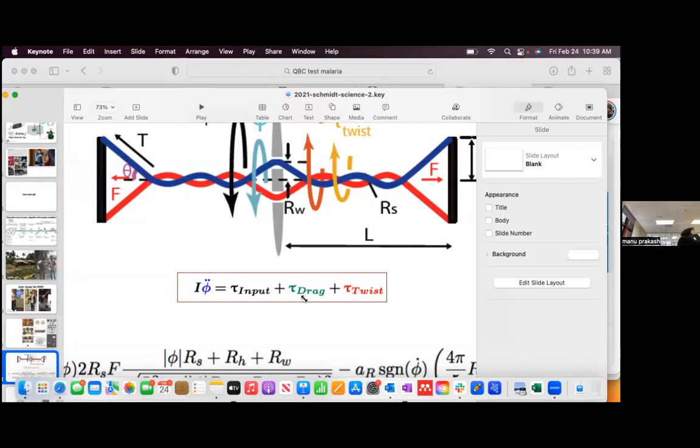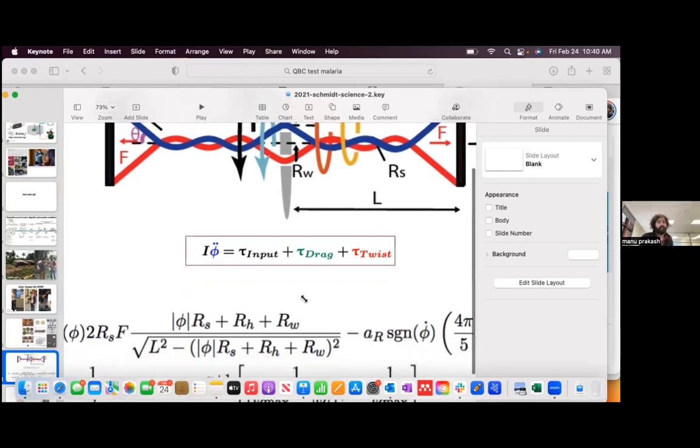Does that make sense? So it's not a classic centrifuge that only spins in one direction. It's actually a centrifuge that will spin back and forth, back and forth. But does it matter? So for centrifugation, the forces are always outward. They don't care about whether you spin a centrifuge clockwise or anti-clockwise, right? So this is how that works.